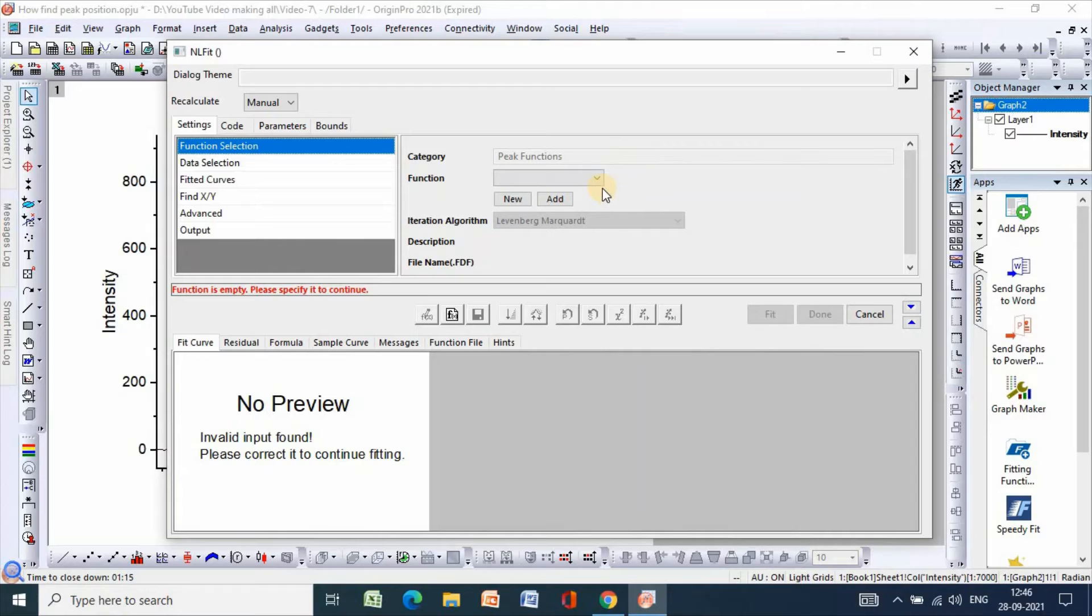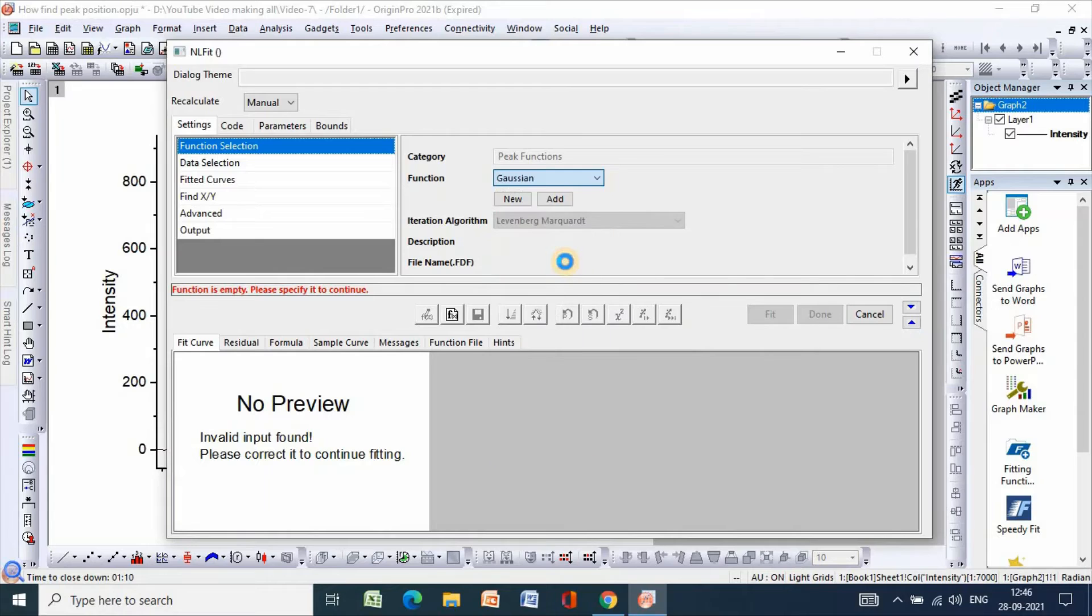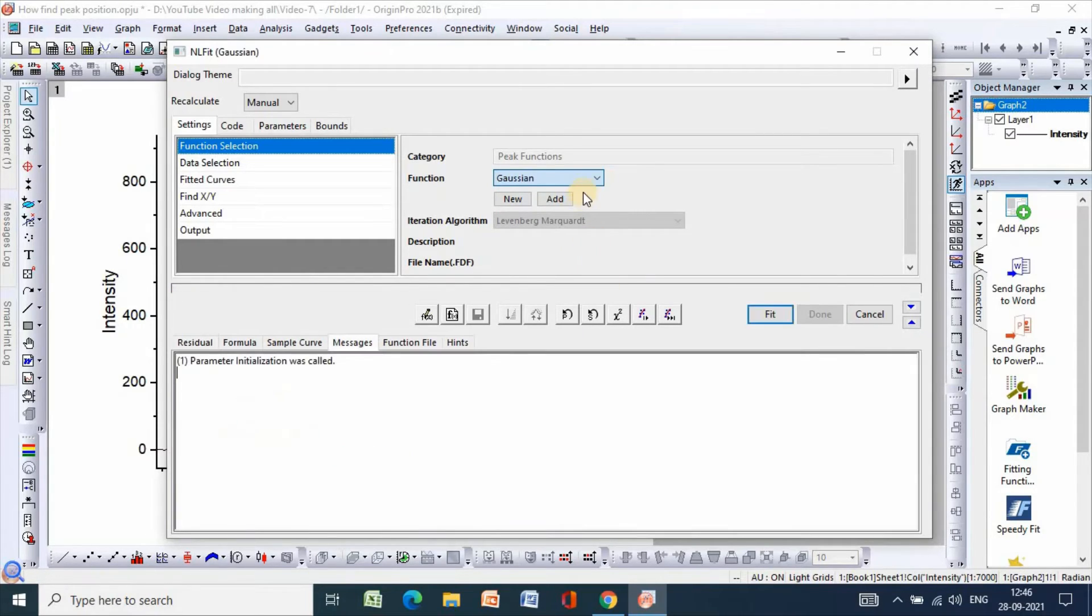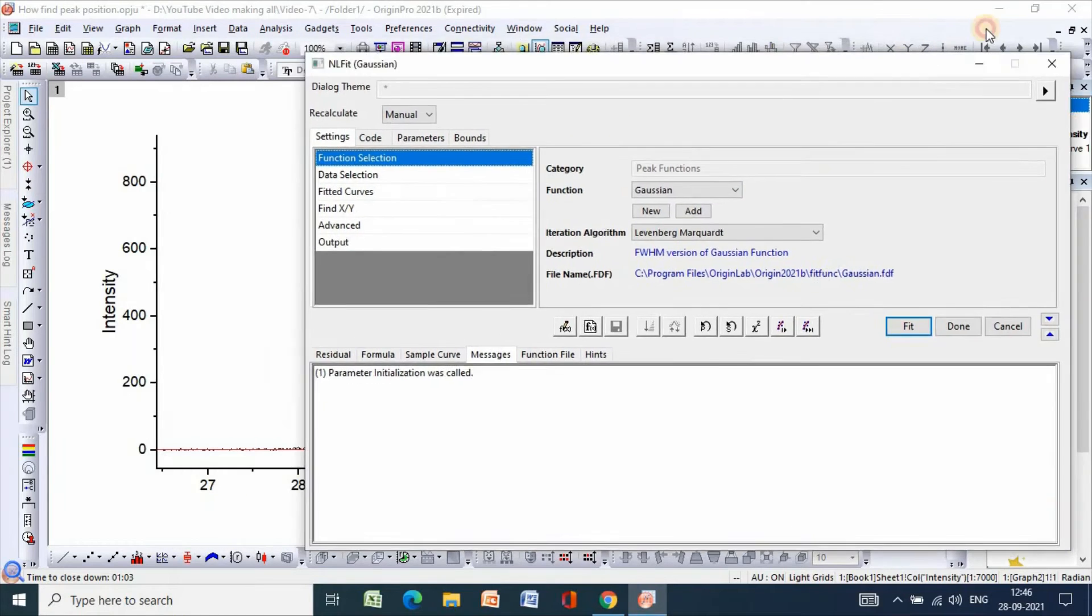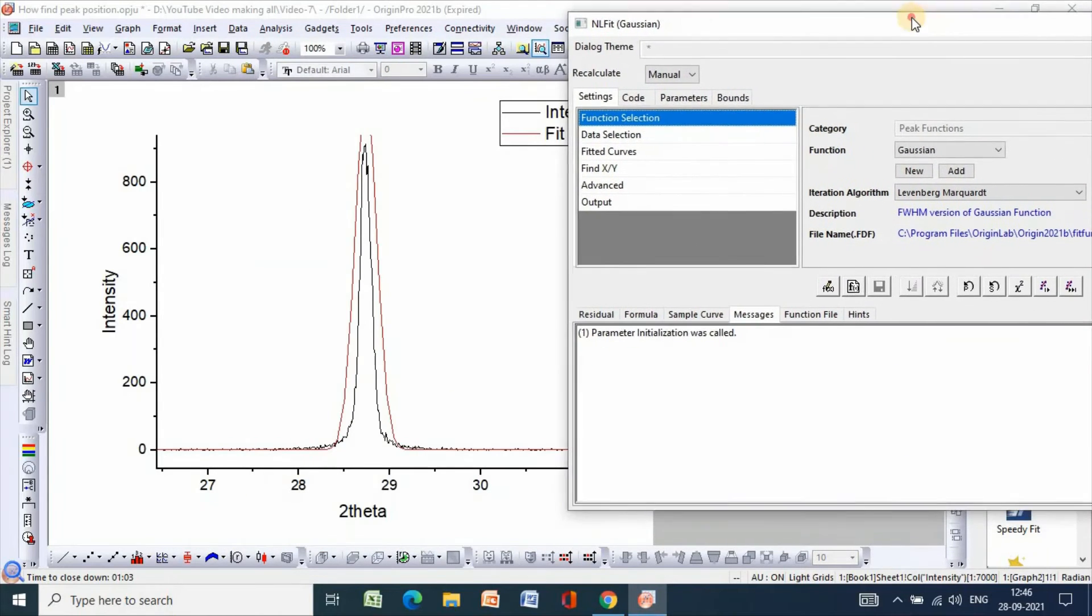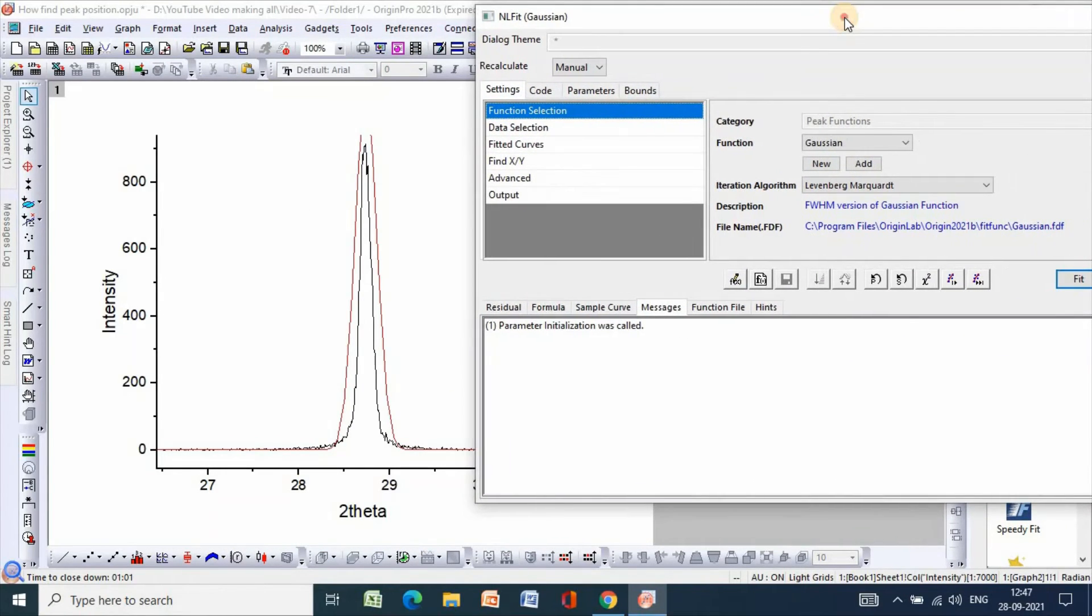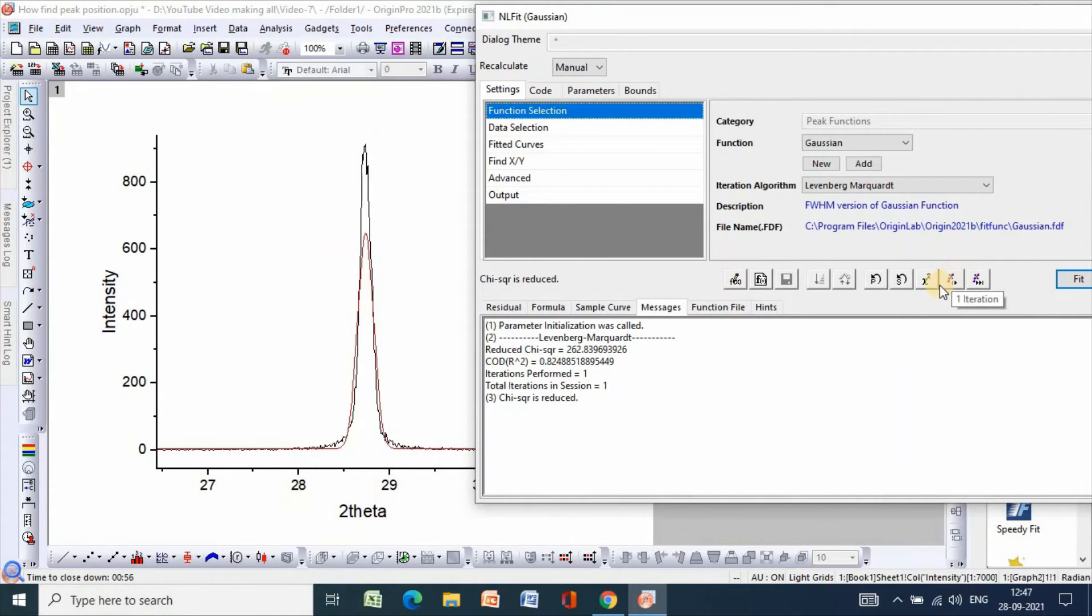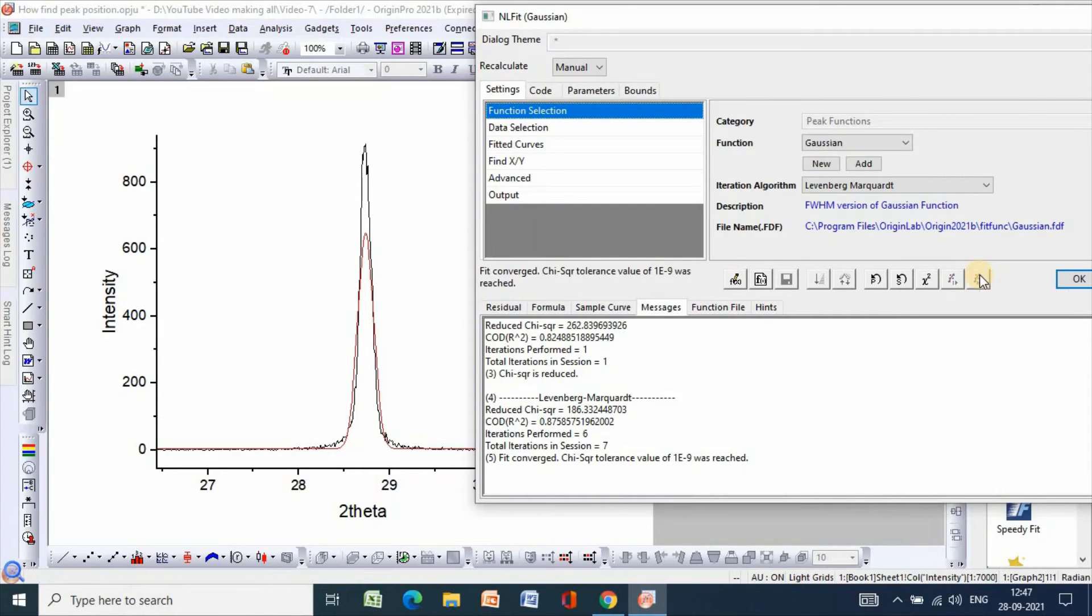So function Gaussian, then click one iteration, then fit until converge, then OK.